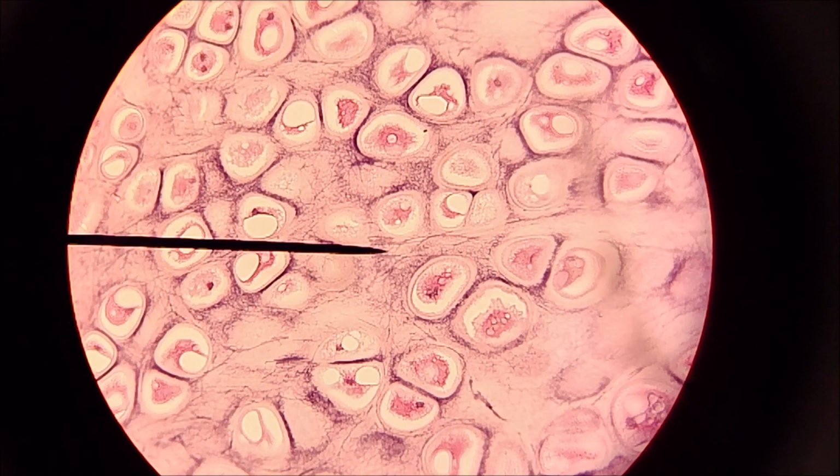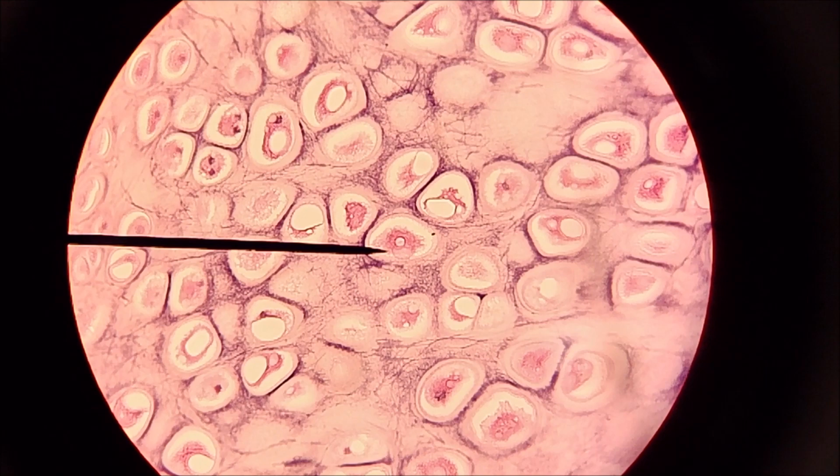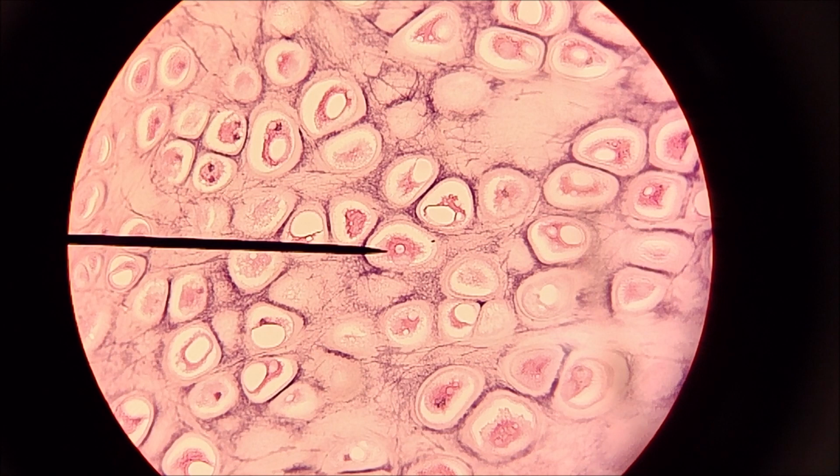Very similar. You can still see a bunch of chondrocytes in lacunae. For instance, I could say on your test, identify this cell. And you say, that's a chondrocyte. And I'd say, what's the opening it's found in called? And you would say, it's a lacunae. And I'd say, where in the body would you find this? And since it's elastic cartilage, you'd say the ear. Okay? That's how this works.